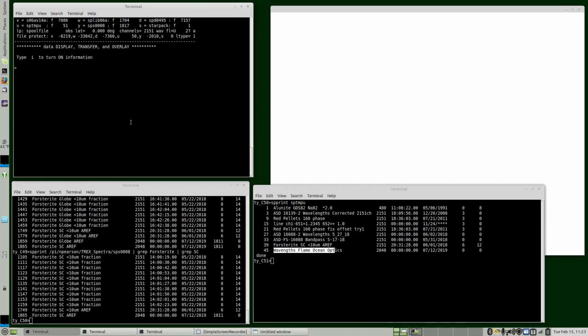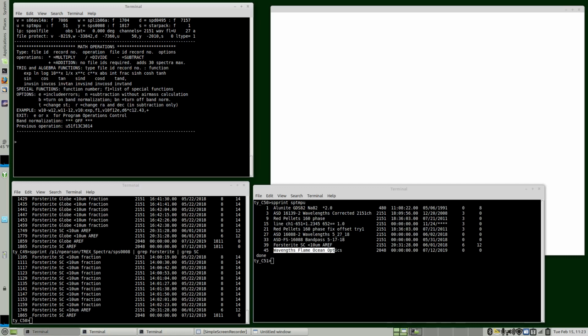So let's go to math, and we'll use a special function called the line segment generator, and we'll do line, have to spell correctly. And that's one of the special functions, F1 through F whatever.